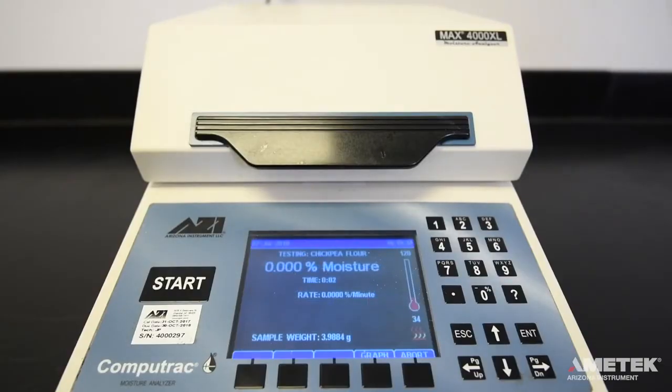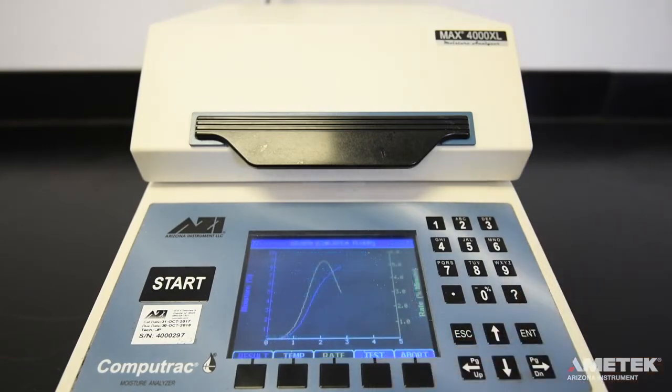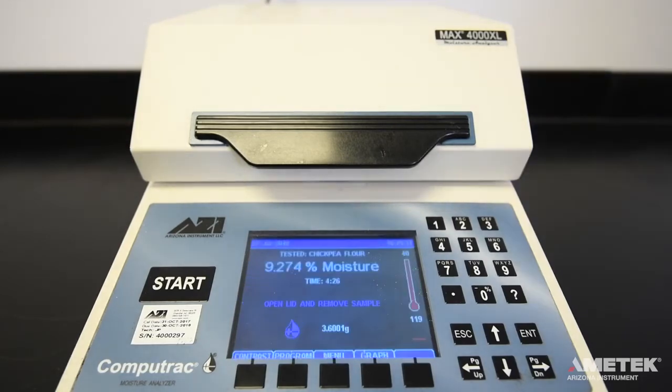The screen will display the target temperature, current test program, test run time, the current sample weight, a real-time percent moisture value, and a percent rate of loss per minute. As the test continues to run, you can select the graph button to see a visual representation of how the percent moisture and percent rate of loss per minute have changed or are changing. Once the programmed ending criteria is met, the instrument will beep, signifying the end of the test.